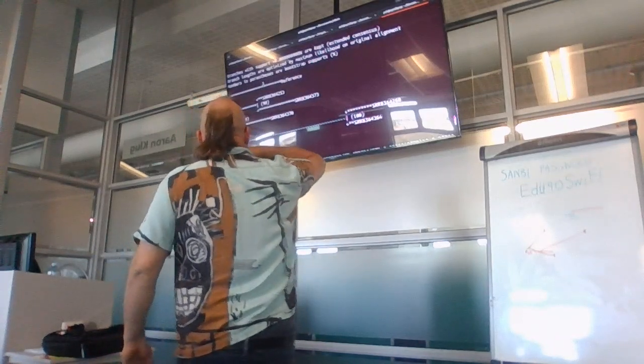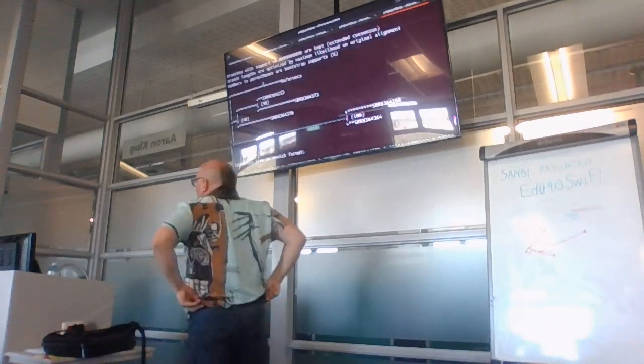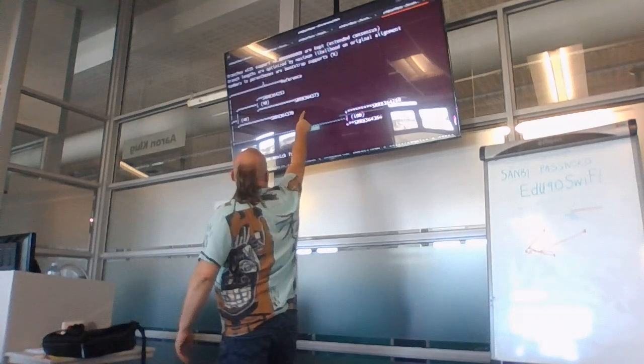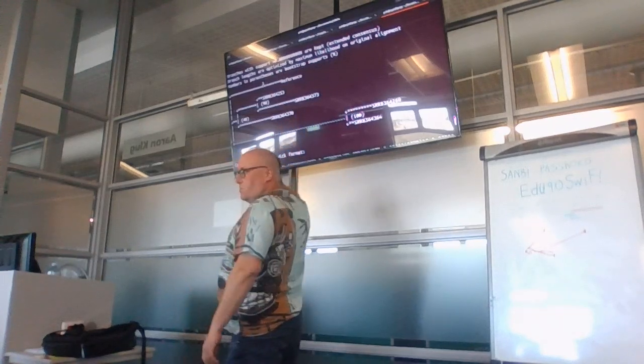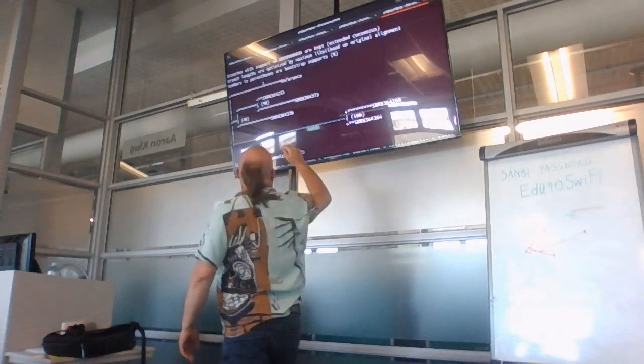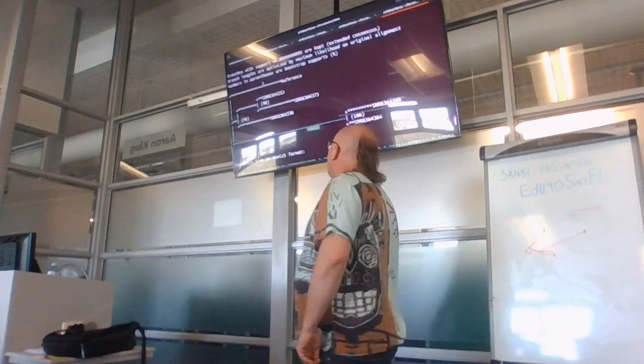That one you can see. So we've got 253 over there, then 373, basically see the two. Like, we use 370 as a reference gene. Are we able to pick up the two samples?